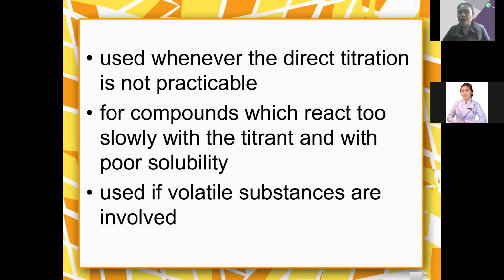Hindi ka makakakuha ng endpoint. Kahit anong dagdag mo ng titrant, no change in color will occur. Therefore, direct titration is not possible. You have to do a residual titration.